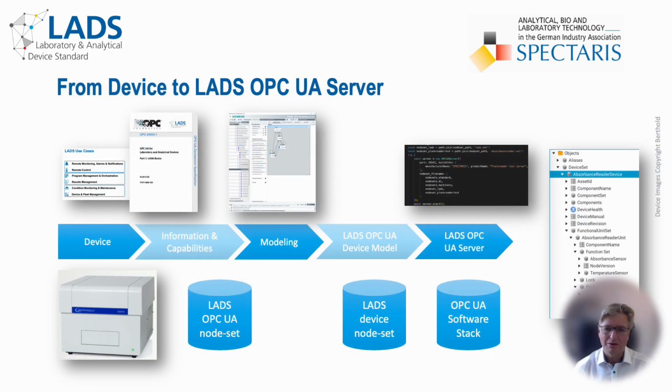This is the workflow that will guide you from your device and its capabilities all the way to a working LADS OPC UA integration. Step 1. Begin by gaining a good understanding of your device's capabilities, the targeted use cases, as well as familiarizing yourself with the building blocks provided by LADS OPC UA.